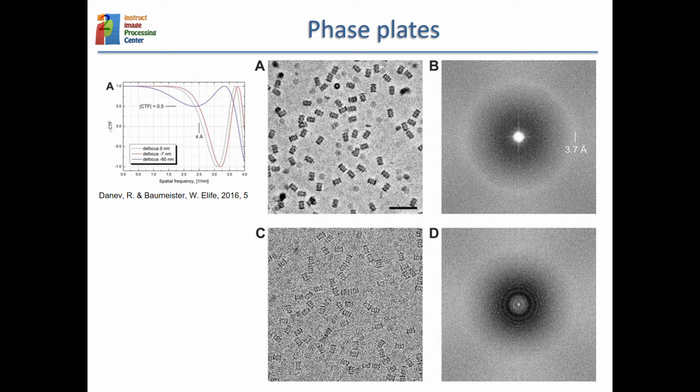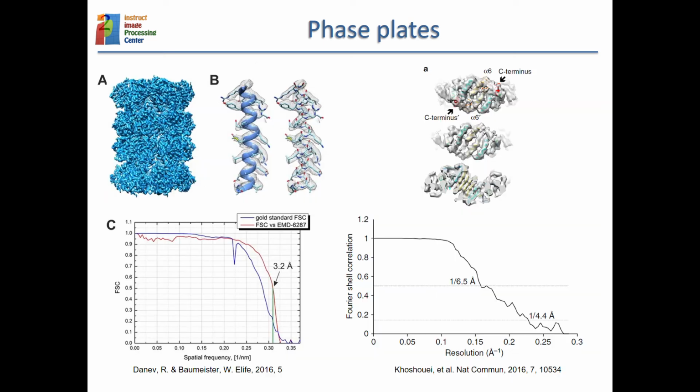There are also a number of issues regarding phase plates, and I don't know if the wisdom is that for very high resolution phase plates are not helping, but for medium resolution, even 3 angstrom, for low weight macromolecules, they can be very helpful. And here you have some examples of structures reconstructed with phase plates.